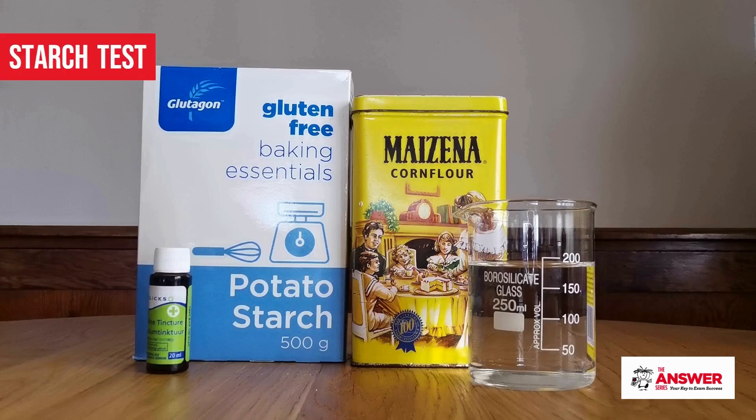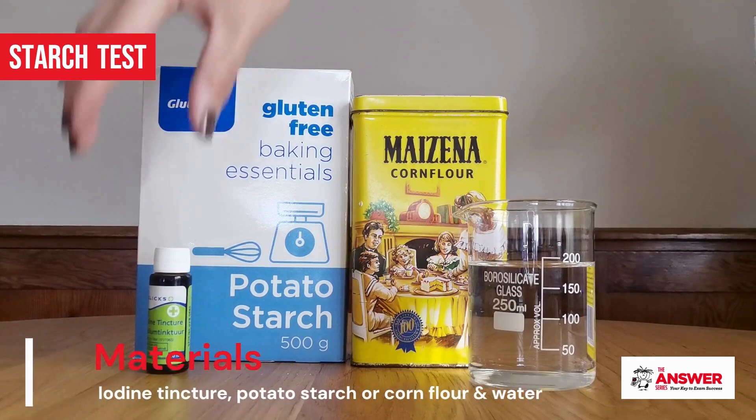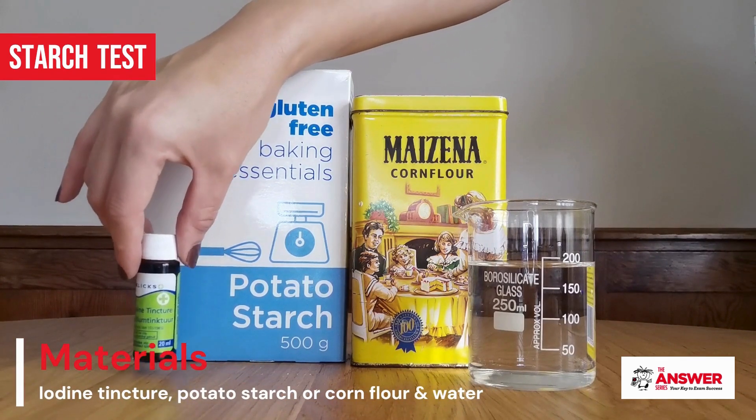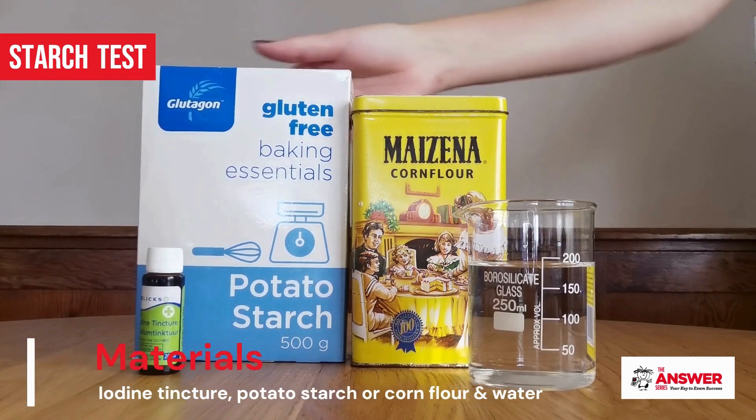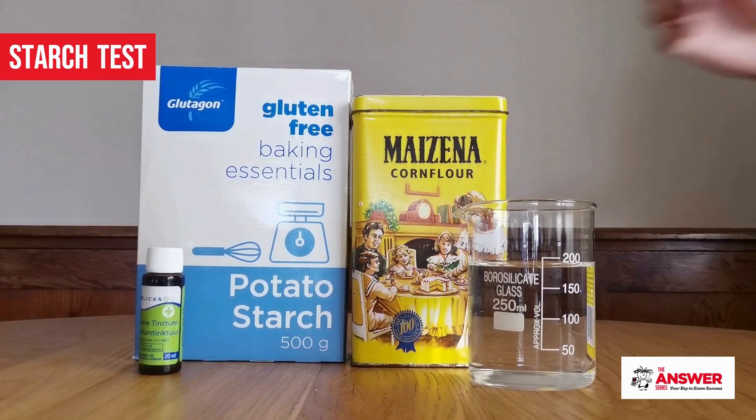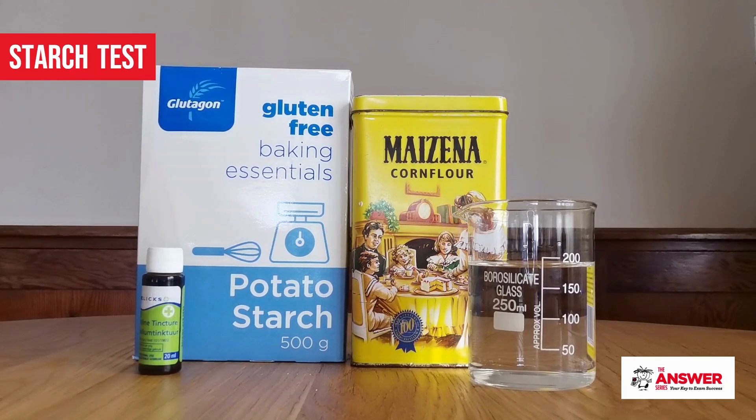The starch test is the easiest one to do, since not a lot of preparation is required. You can simply buy the prepared iodine tincture, and then you need some substance that contains starch. You can use potato starch, corn flour, or any of the various starches that are available in stores today with all the gluten-free options out there.